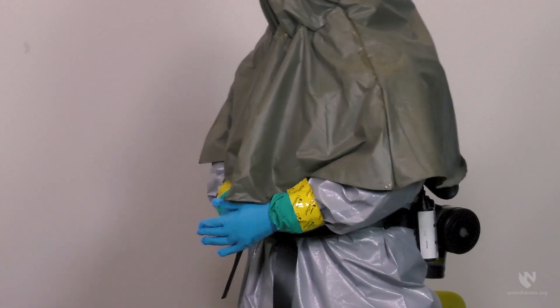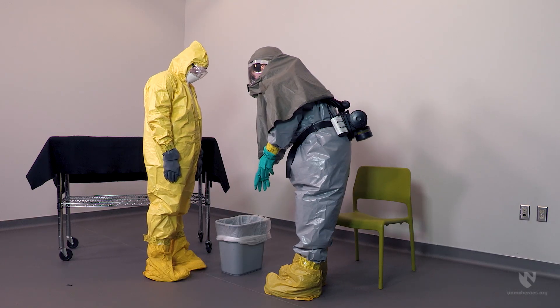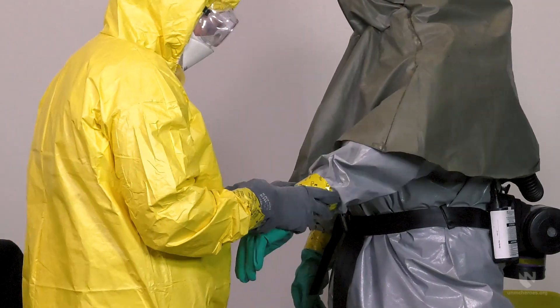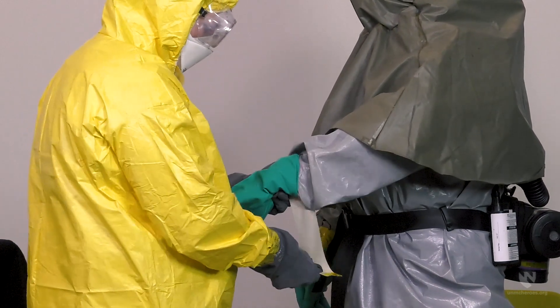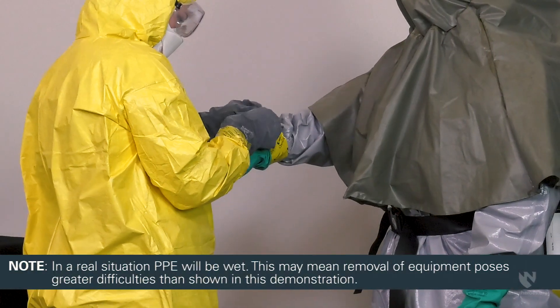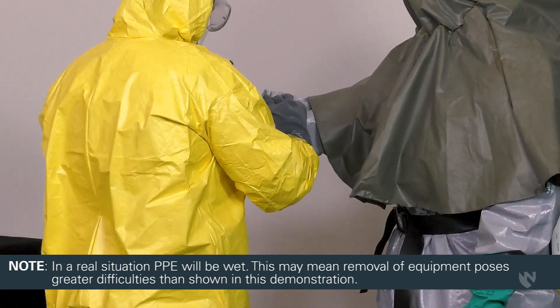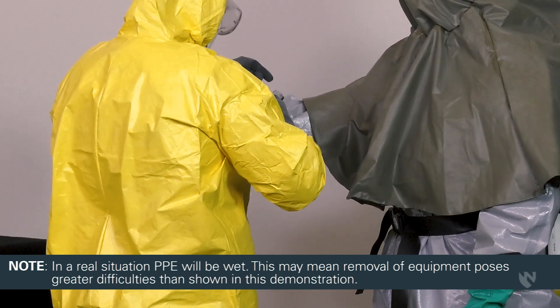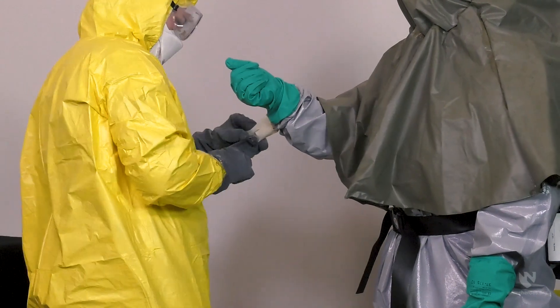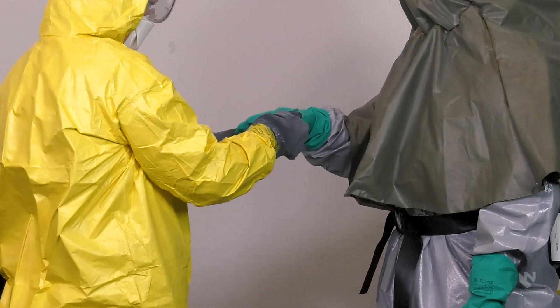Begin by removing the patient care gloves that were worn on the outside of the outer protective gloves. The doffing partner should then remove the tape sealing the outer protective gloves to the suit. The outer protective gloves can then be removed and discarded.